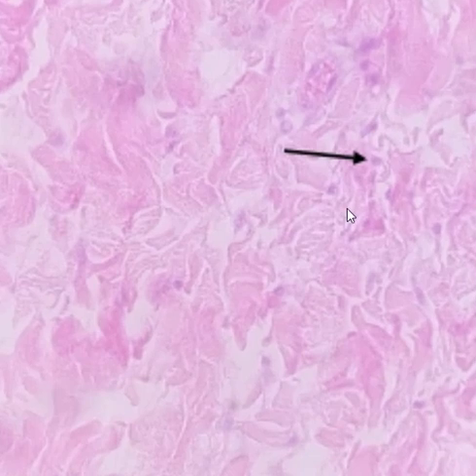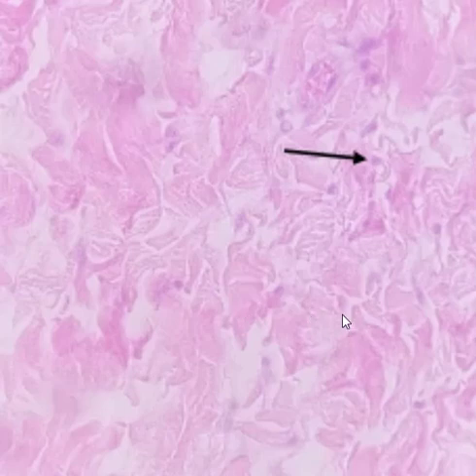So if you look, you've got the collagen fibers, but they're going in all different directions. Here's a little bit going off in that direction, a little bit going off in this direction. And so I need the strength, but I need to be able to move more than you do for the tendons and ligaments. So where are you going to find this?